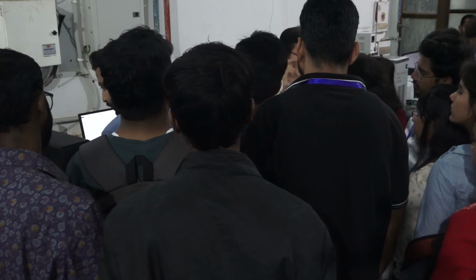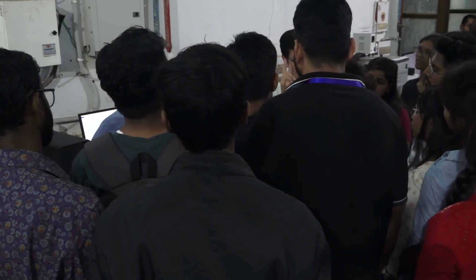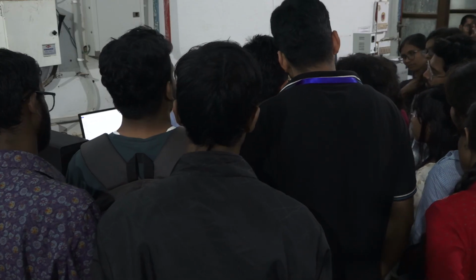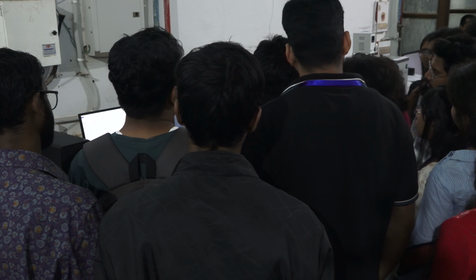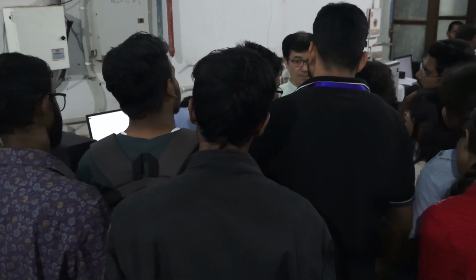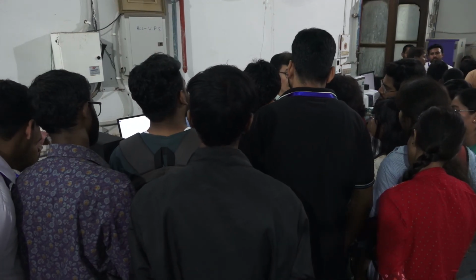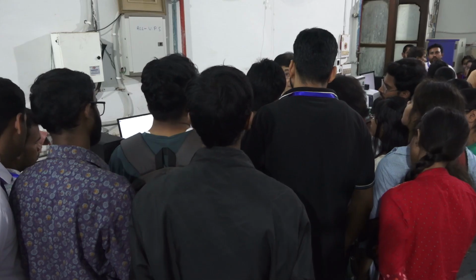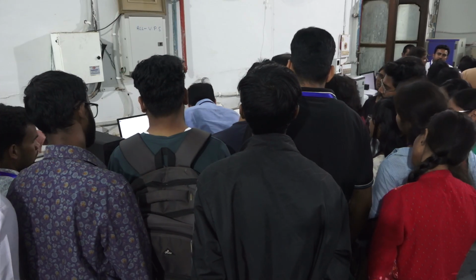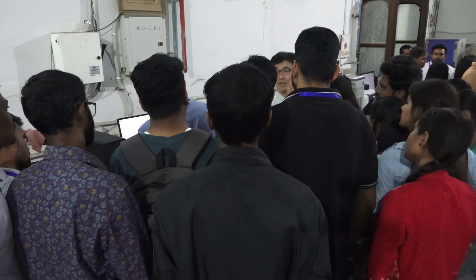So we record two spectra. And to record one spectrum, we need to scan twice. One is I0 without any sample, and the other is I with sample. Then I over I0 is related to absorbance or transmittance. So 2 scan gives 1 spectrum, 2 scan gives 1 spectrum. So today we need to do 4 scans. Okay?